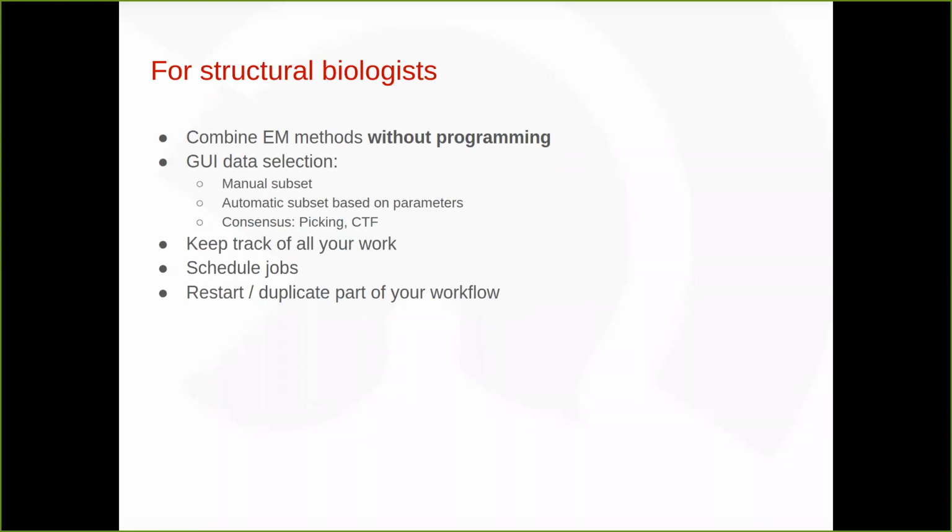Obviously, you can keep track of all your work, and you can even use that information in your paper when you are going to write it down. You can go back to the project and see all you have done and report every detail. You can even attach the JSON file to the paper as extra files, or I guess that should be fine.